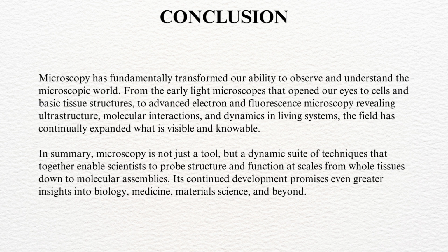So here is the conclusion of this presentation: microscopy has fundamentally transformed our ability to observe and understand the microscopic world. From early light microscopes that opened our eyes to cells and basic tissue structures to advanced electron and fluorescence microscopy revealing ultrastructure, molecular interactions, and dynamics in living systems, the field has continually expanded what is visible and knowable. So, microscopy is not just a tool, but a dynamic suite of techniques that together enables scientists to probe structure and function at scales from whole tissues down to molecular assemblies. Its continued development promises even greater insights into biology, medicine, and material science.